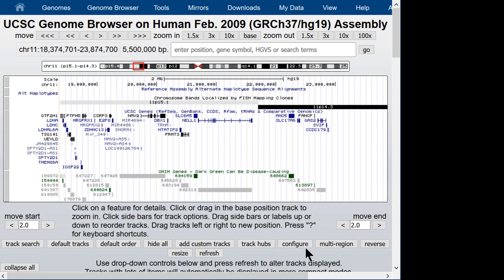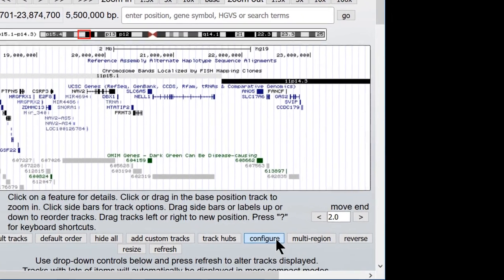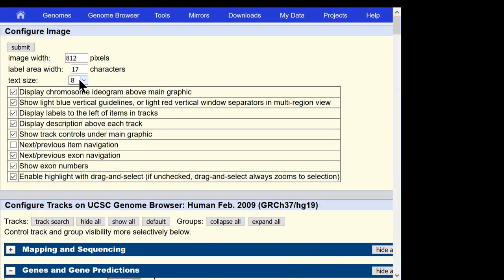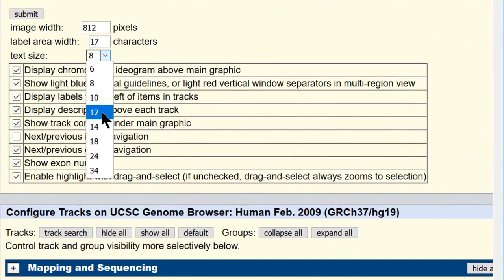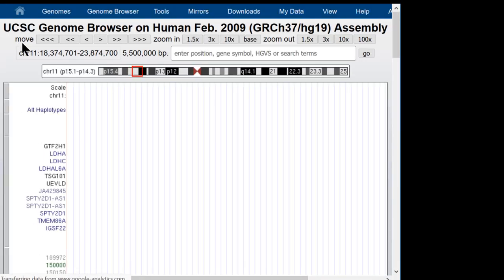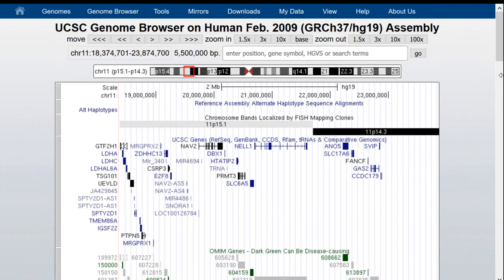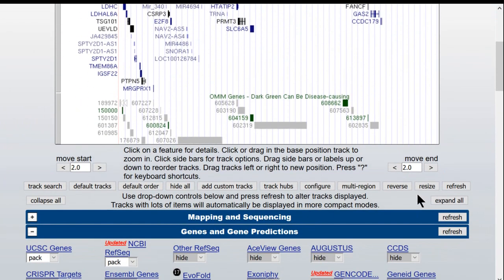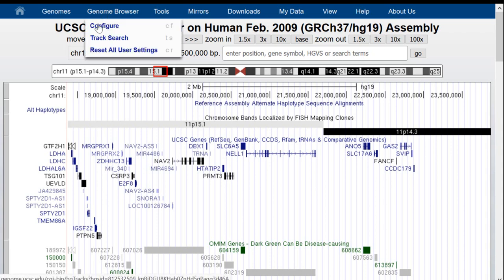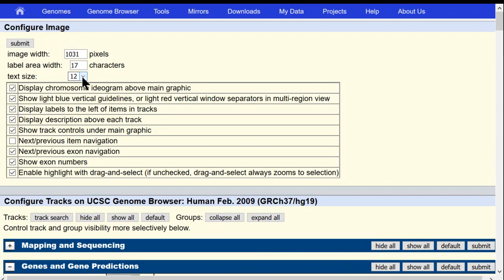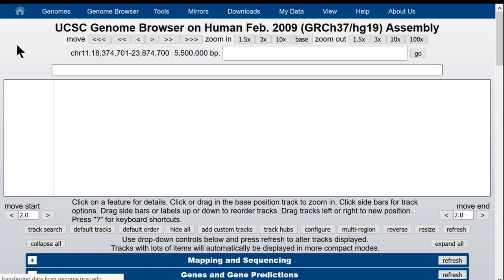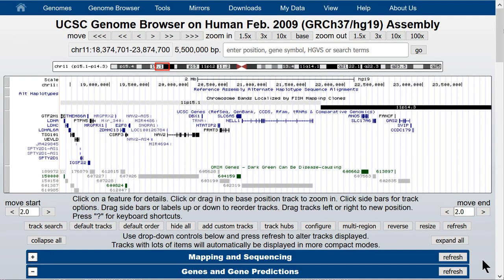Speaking of type size, there's a configuration button below the browser graphic that gives you the option to change the font size. You can change the text size, for example from 8 to 12, and after submitting, the browser will redraw with text at that larger size. Note that this is a global configuration distinct from the bar at the left side of the data tracks, which is a configuration option for that track only.